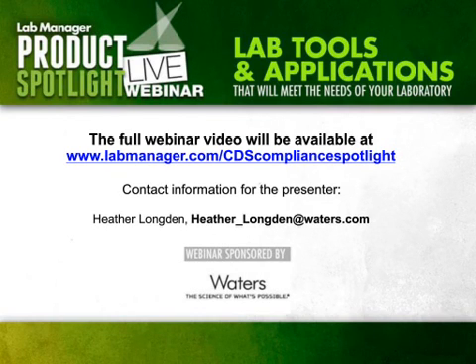On the calculations, if you are doing personal calculations that are specific to your laboratory, just as if you were doing them in an Excel spreadsheet, you need to be sure that you put those calculations in correct and they give the right results. And a short validation of a particular calculation that you've built in yourself seems to me to make perfect sense to do, but it doesn't need to be a 400-page validation report. Simply, these are the numbers, this is how I've built it, this is how it's designed to work, this is how it will error, and here are some test cases where I challenged, did I do it right? And then locking it to prevent further changes is probably what's mostly required. But the questioner sounds like they have a good control of that process.